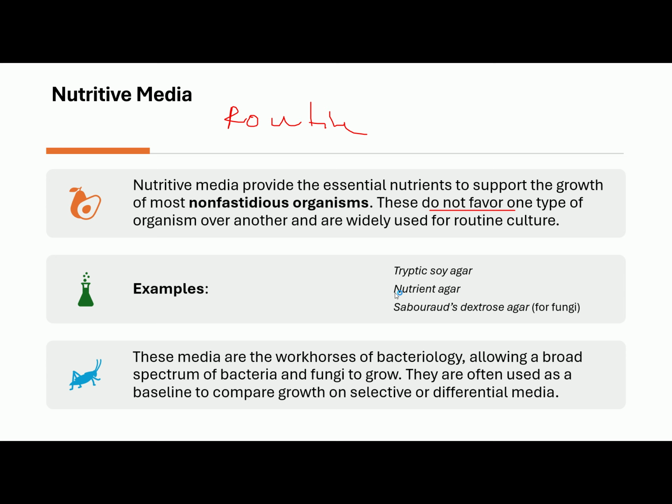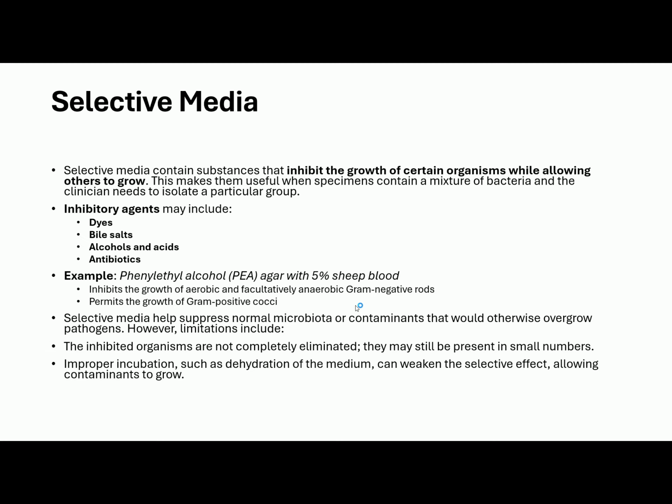Examples are your tryptic soy agar, nutrient agar, Sabouraud's dextrose agar. Now, these media are the workhorses of bacteriology, allowing a broad spectrum of bacteria and fungi to grow. They are often used as a baseline to compare growth on selective or differential media.